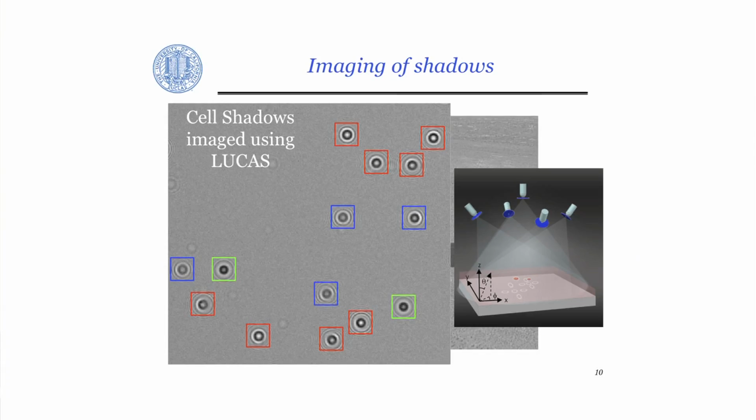Well, that's based on actually imaging of shadows. Since you don't have a lens to form an image, we detect the shadows of specimen. What is different here is that our shadow is pitch dark. It doesn't contain anything useful because we're opaque to light. But if you look at cells, because they're tiny, they let the light penetrate and they cast a unique shadow, which is structured, which contains some texture. So if you were to look at some microscale particles or cells, they would form these unique shadows, which you can treat like the fingerprint.